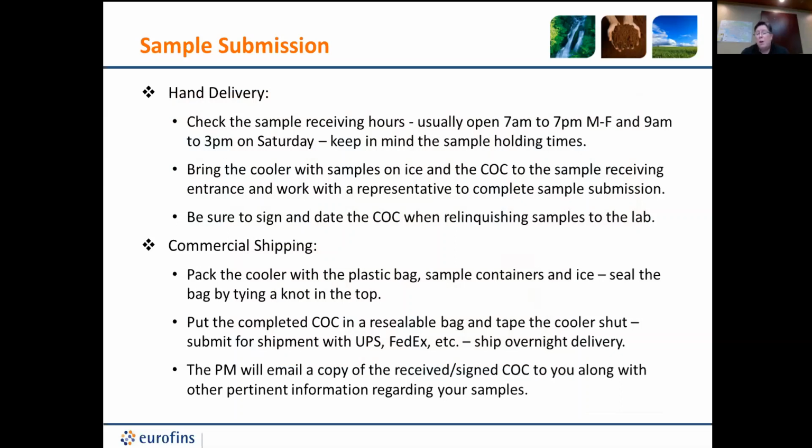Bring the cooler with samples on ice. Again, if it's the same day, like you've just collected the sample and you're coming straight to the lab, there is a way that we can note that and you'll still be okay. Just make sure you do what you need to do to get it to us.